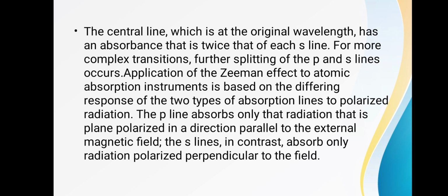The center line, which is at the original wavelength, has an absorbance that is twice that of each of the other lines. For more complex transitions, further splitting of the P and S lines occurs.